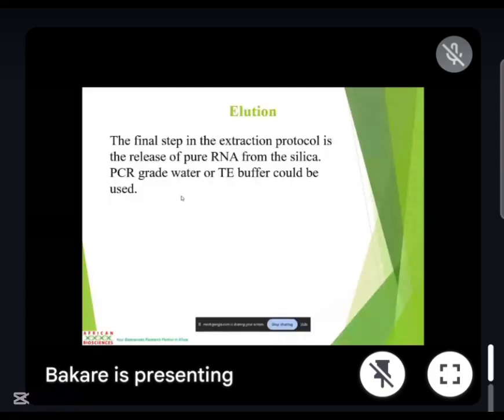then you place it, I hope we are with our pipette, at the middle of that filter column, because if you put it on the wall of the tube, you are not going to elute your DNA. The DNA or your RNA is at the middle of that column. So you have to make sure that that elution buffer also goes to the center. So once you dispense the 100 microliter elution buffer, then you let it stand for 1 minute. Once you let it stand for 1 minute, then you now centrifuge for another 1 minute.